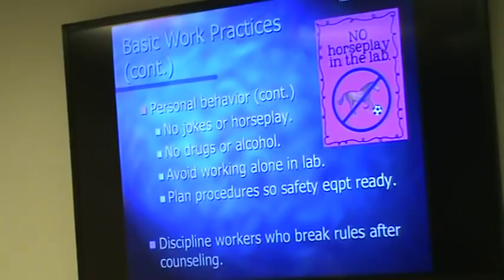She had something that she wanted to do, and she was drying some chromatography plates or something in an oven, and she pulled the door open before they were completely dry, and the heated volatile chemical hit the oxygen and it blew up on her. And when the folks came in for day shift, she was on the floor passed out cold.